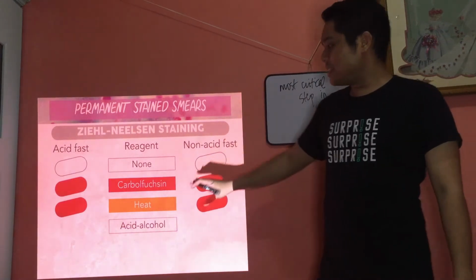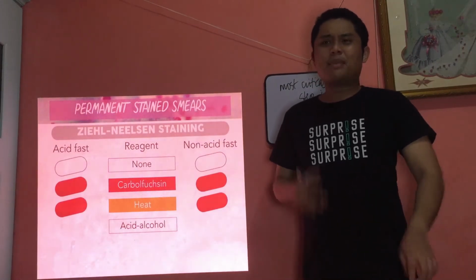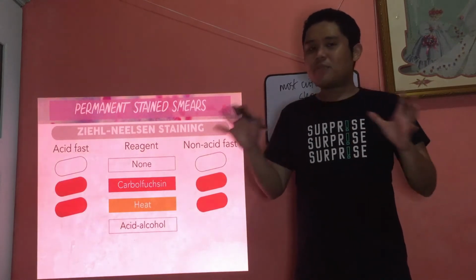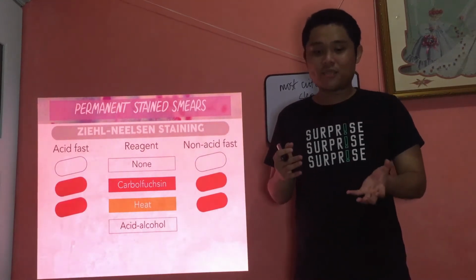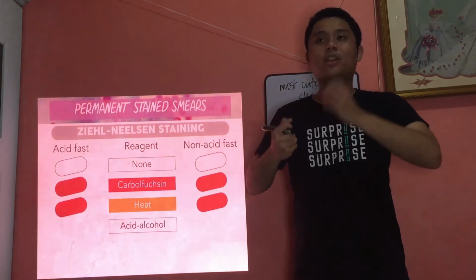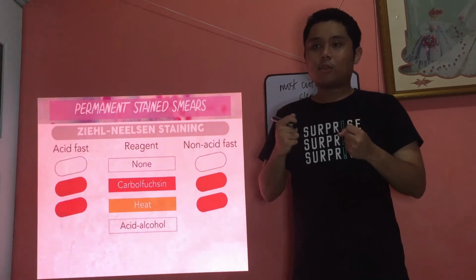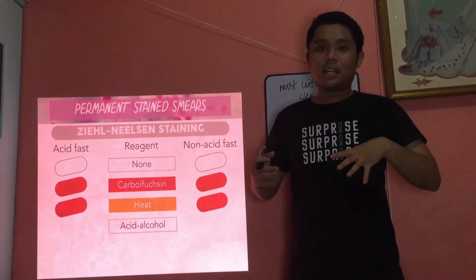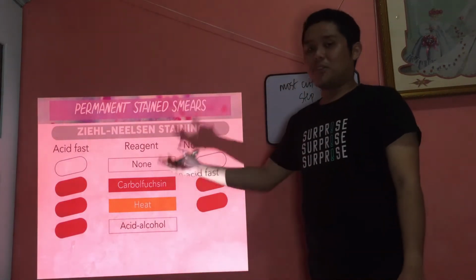So let's say, pag add sa decolorizer, what do you think will be the color of acid-fast? Because strong man yun siya, acid fast man yun siya, like real acid fast yun. Long chain fatty acids marami, mataas ang content sa kanyang cell wall ng long chain fatty acids. So strong ang pagka-bind between carbofuchsin and your organism. So pag-add sa decolorizer or your challenger, the third party, dili sila mabungkag. So therefore, your acid-fast organism will remain red.